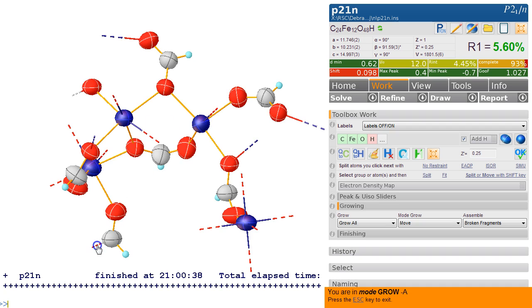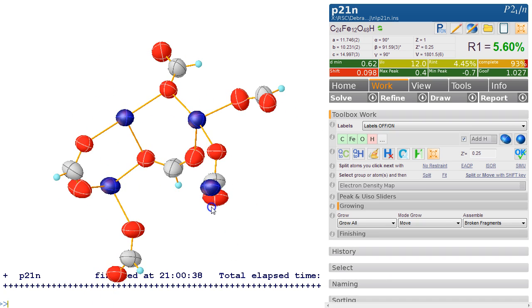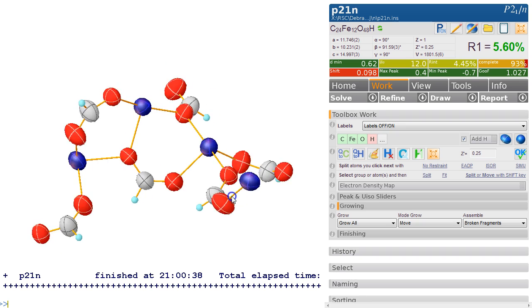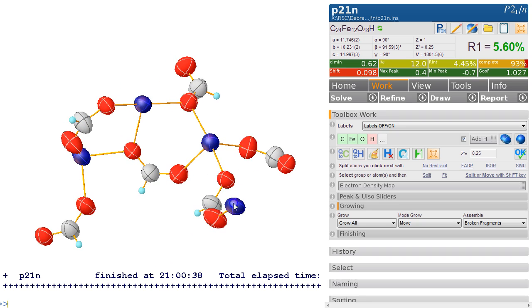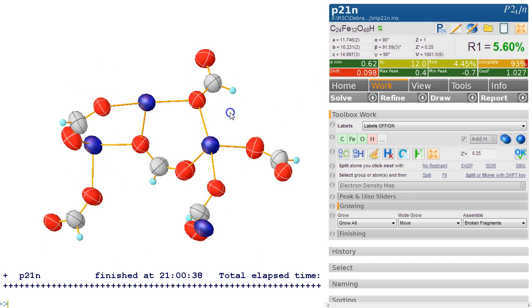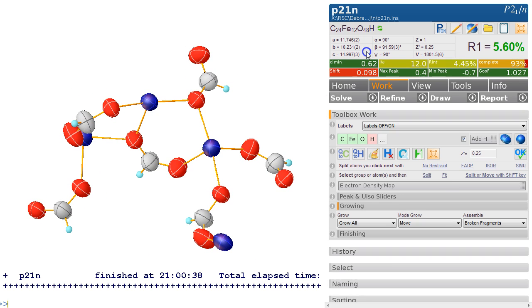and the last one here. So this was that one. Now what we've got is a fairly clear picture of what's going on. This asymmetric unit has got iron and then it's bridged by these formates.